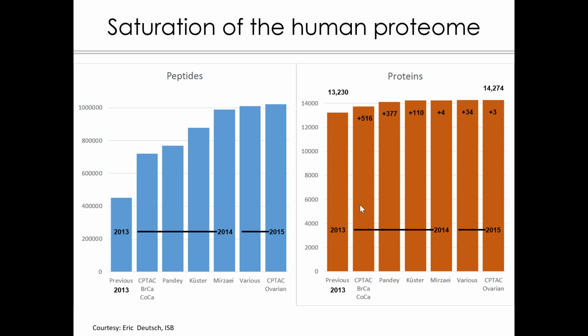So this is a peculiar situation: some people published a paper saying we have basically covered the whole proteome as a map, and the public effort, which combines basically the majority of the publicly available data, cannot reach that level. The level is about 14,000 to 14,500 proteins, and this is short of the roughly 20,000 open reading frames that are thought to be in the human genome. So the question was, where are the discrepancies? Why are these numbers different?